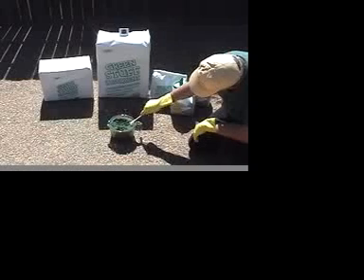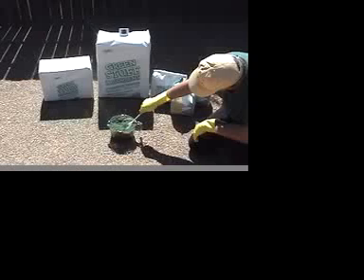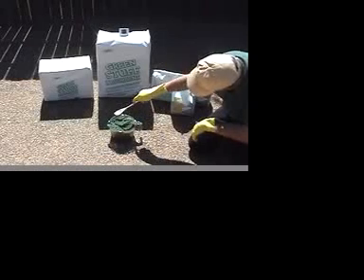Using a wooden spoon, we'll mix some of the GreenStuff with the acid.